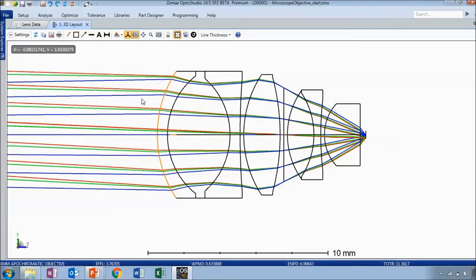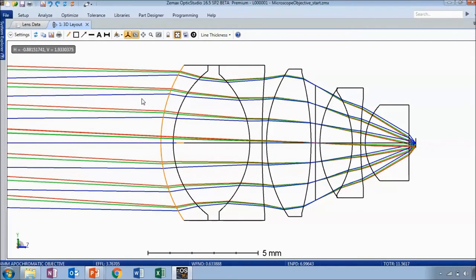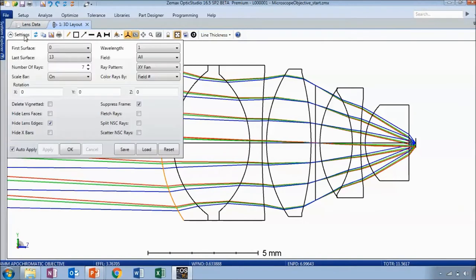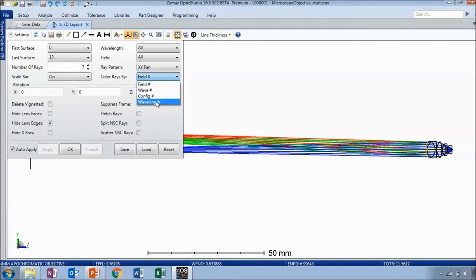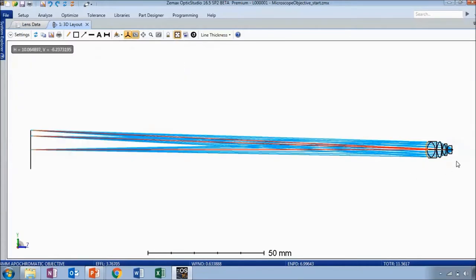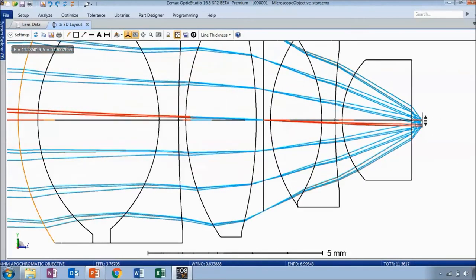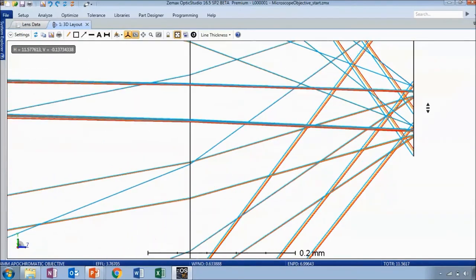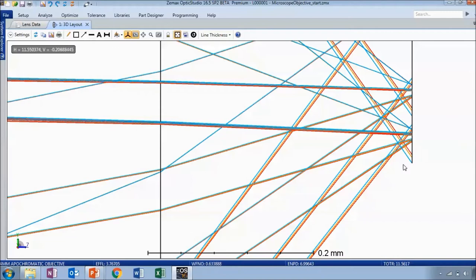Click OK, and that looks much more reasonable. The settings here have the rays colored by field number, but I did add additional wavelengths. I can change the rays to be colored by wavelength, in which case OpticStudio will choose a color closest to the true wavelength color you've selected — this is really only applicable in the visible spectrum; otherwise the rays will be drawn black. Or you can select wave number, which assigns a unique color to each wavelength defined.